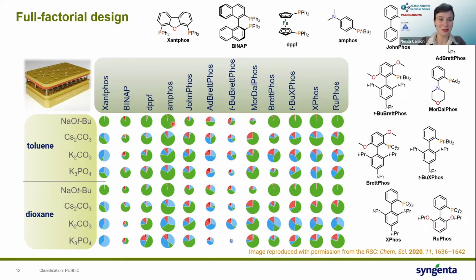That's my desired product. I have blue and reds, those are the starting materials, and then 2 side products in different shades of blue. I do try to avoid red and green combinations now. This is old data, and I shouldn't have been using that. It's not great from a color blindness perspective. But this is what it tends to look like.